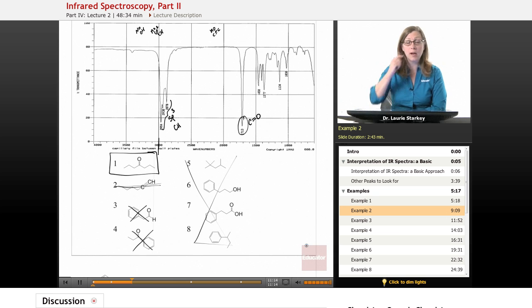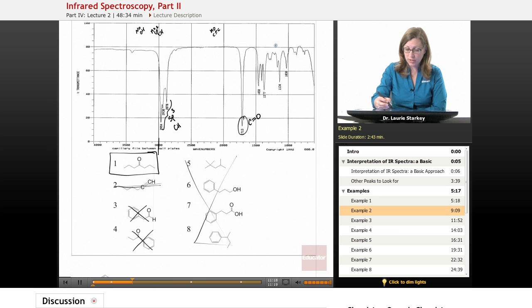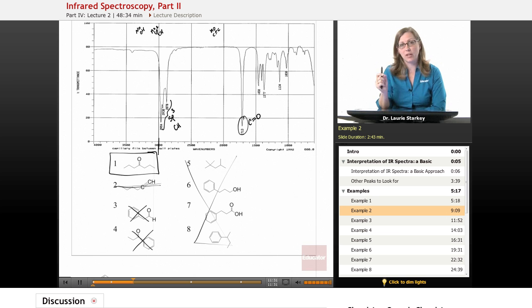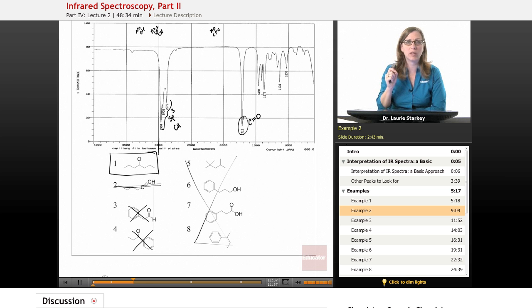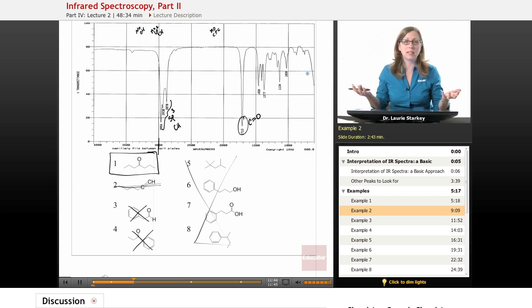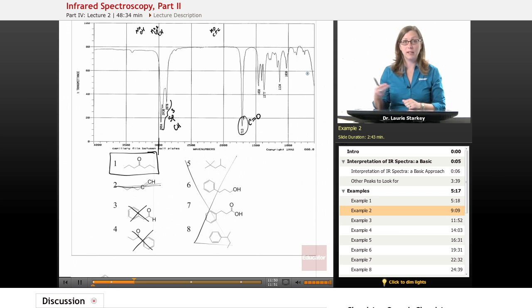Is there anything else to look for? Really there's nothing else. Look at all those peaks in the fingerprint region that we're just leaving alone. Sometimes that's going to be frustrating, but the key to solving IR problems is knowing which peaks are significant and being able to pick those out. We have to resist the temptation to label every single squiggle and wiggle — they simply represent the molecule bending and wobbling, and that doesn't tell us anything diagnostic. Just those two peaks are all we need to label and positively identify the structure.